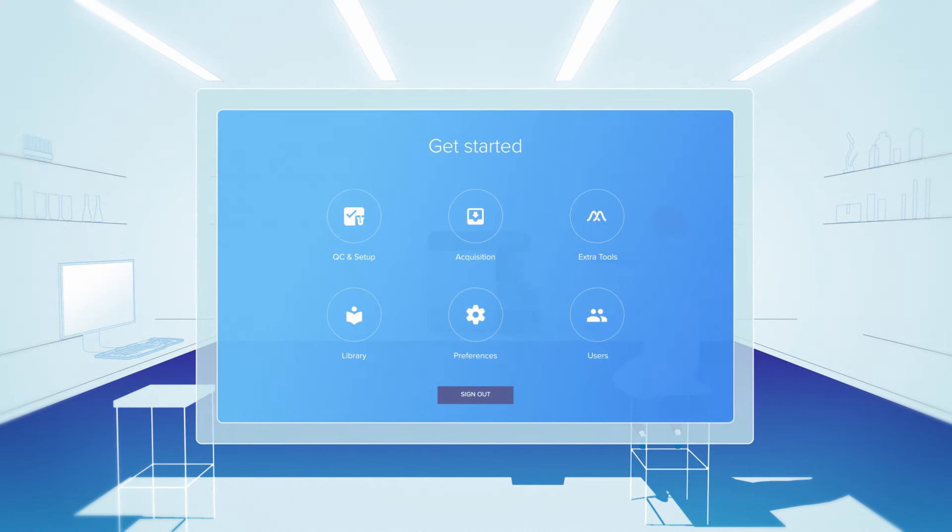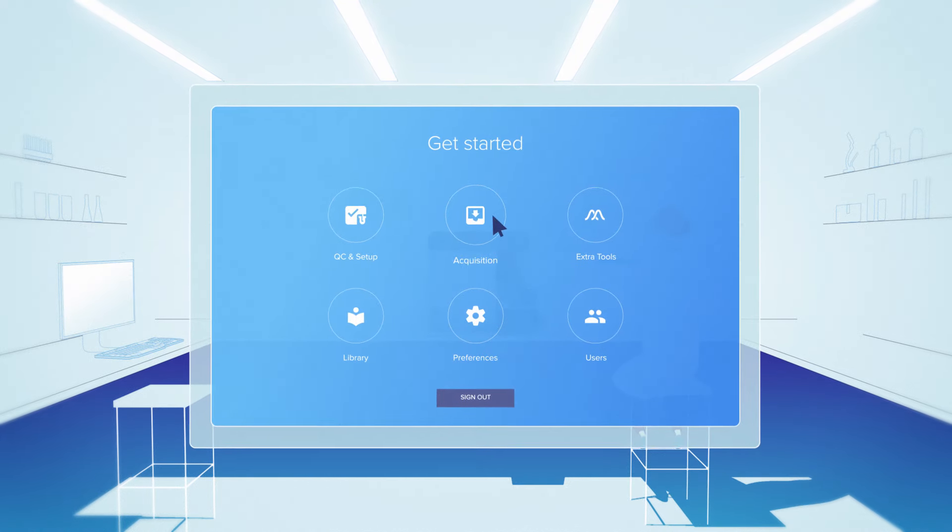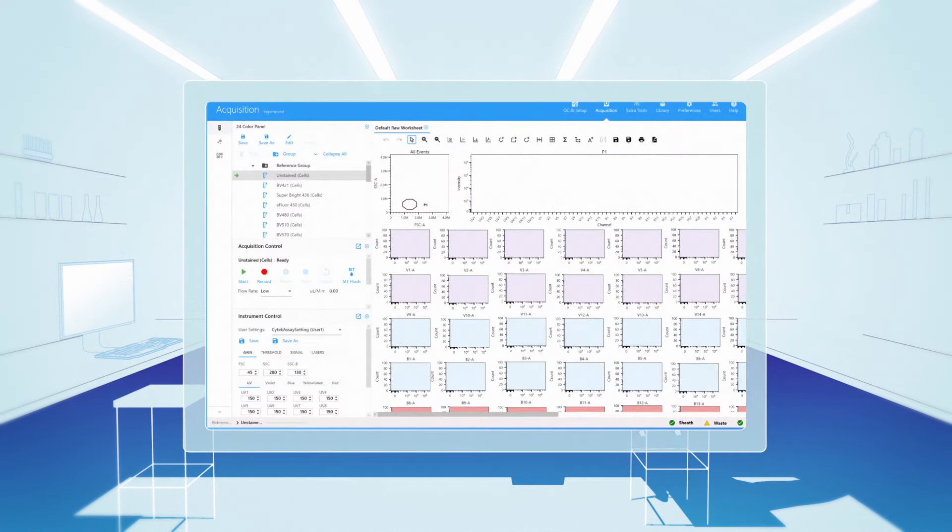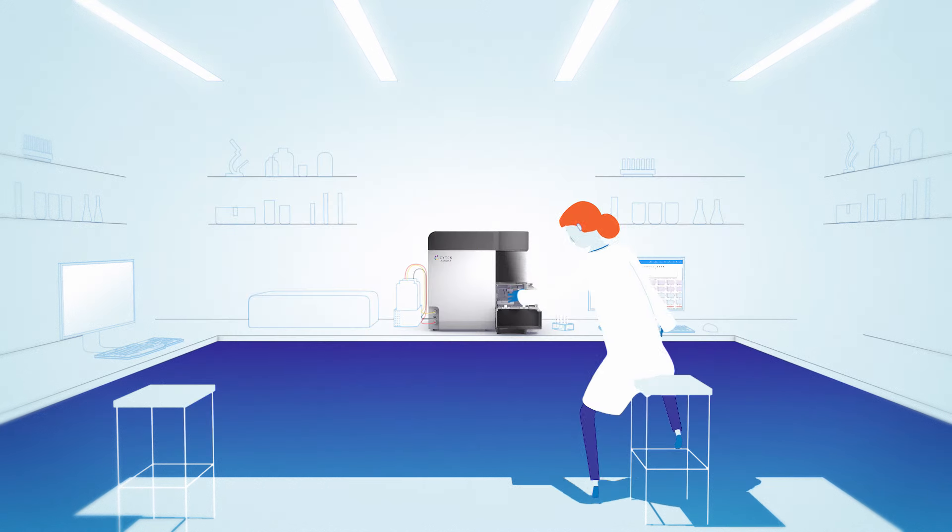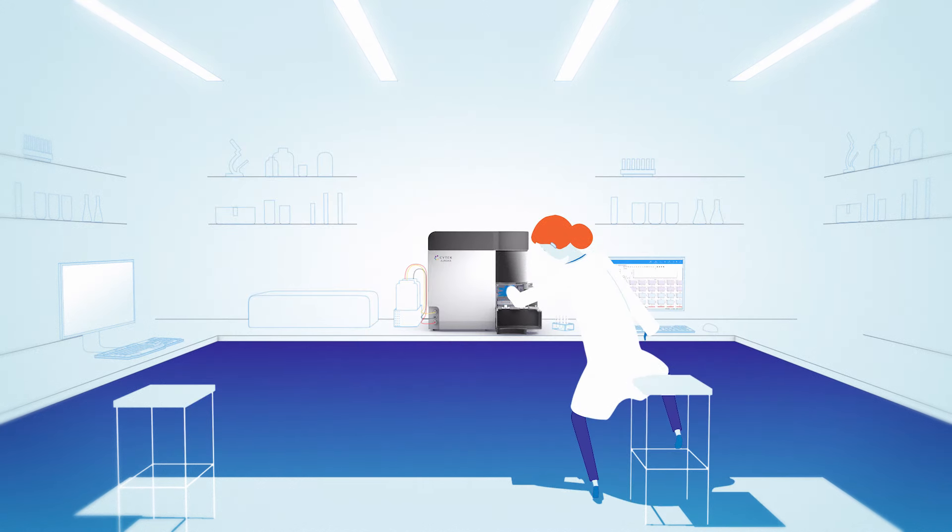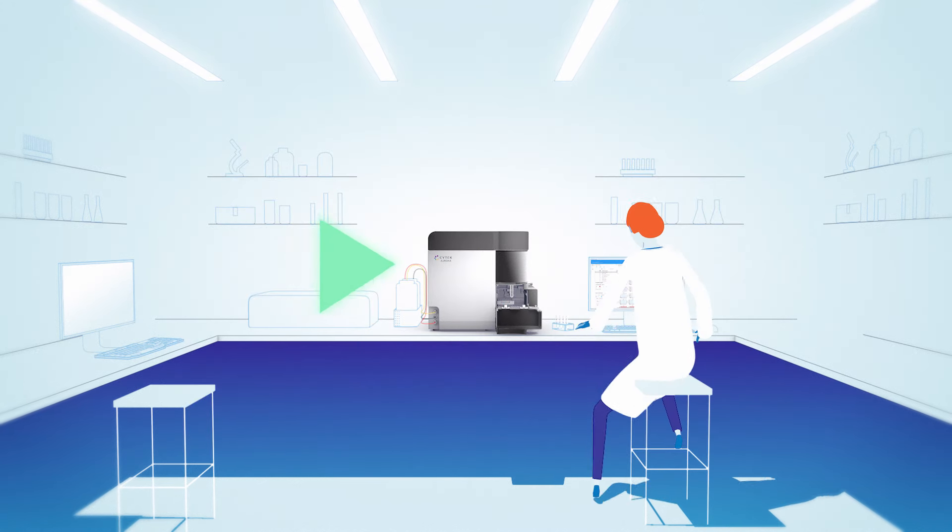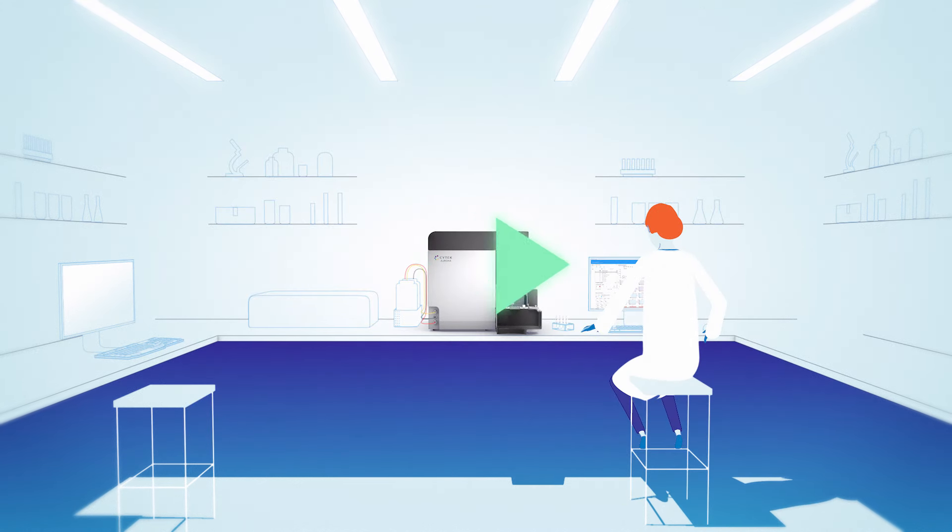Operating the Aurora is simple and intuitive. Set the instrument's settings with one click, load the sample tube onto the Aurora, and click Start to begin collecting sample data.